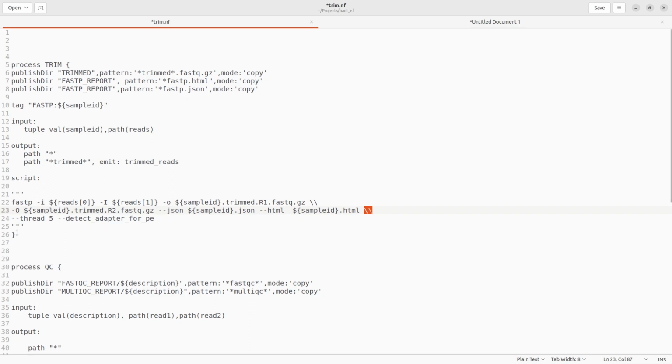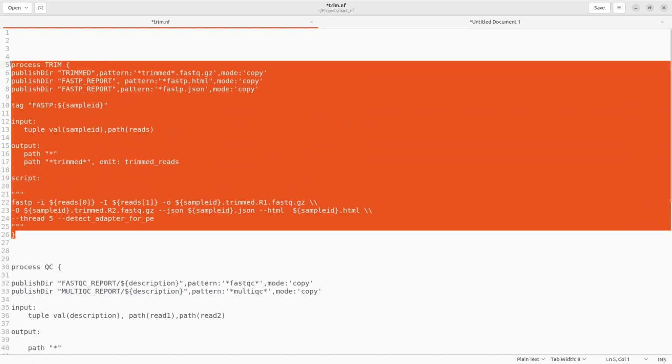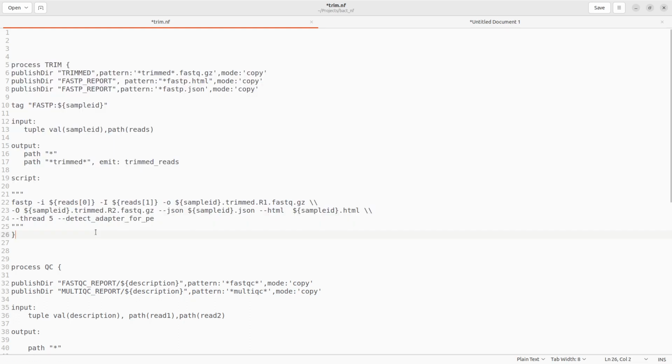So that's what this simply means. So this is the process string. So we are going to get this into our script and then we are going to run that first and then proceed. So we are going to test them one by one and then we will see how it goes. So now I'm going to shift to the terminal and we can proceed.